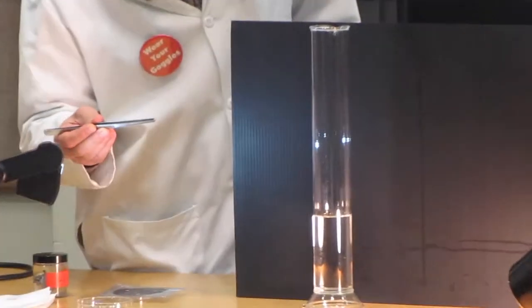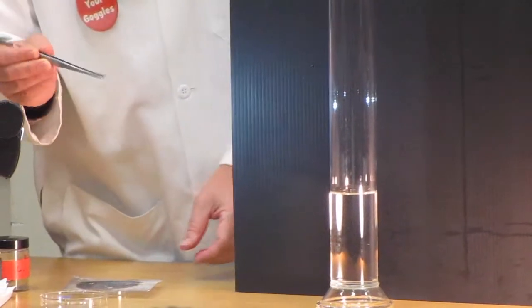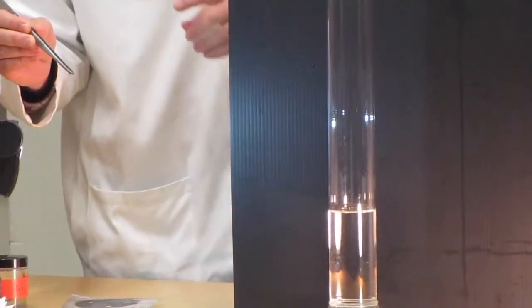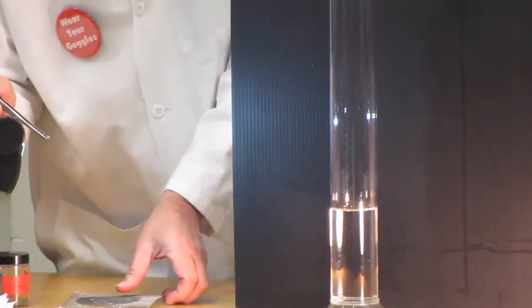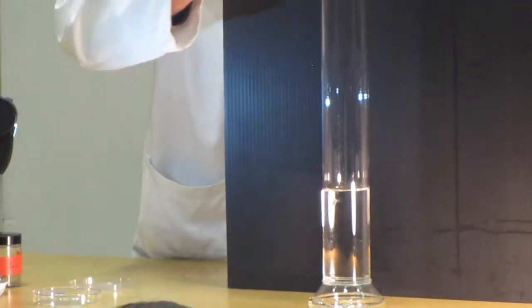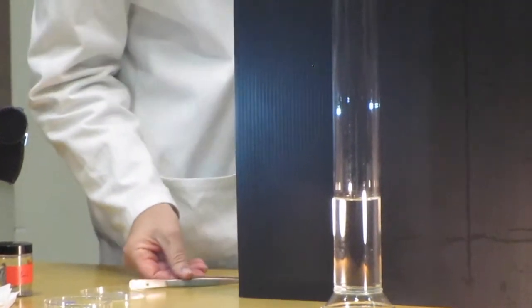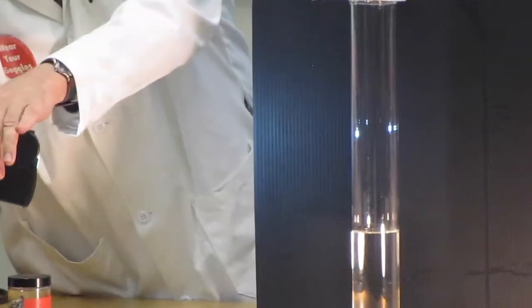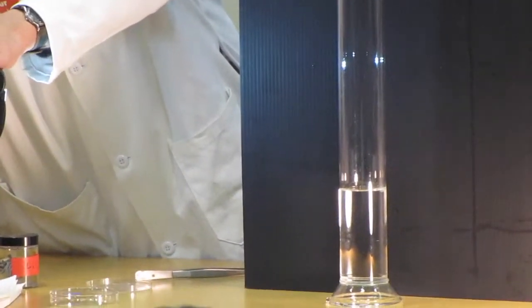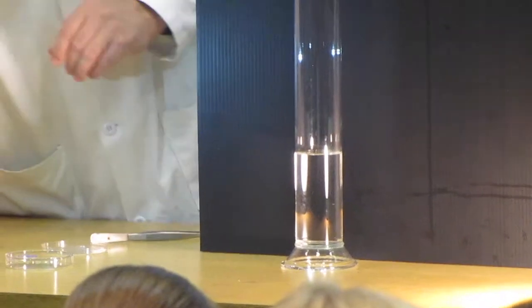So we're going to put it in here and try to react it with water. So one of the physical properties we know already is fairly soft. And let's see how it reacts, or if it reacts with water. It's pretty exciting. No, it's not. But it gives us a basis of comparison. So is it reacting? Yeah.